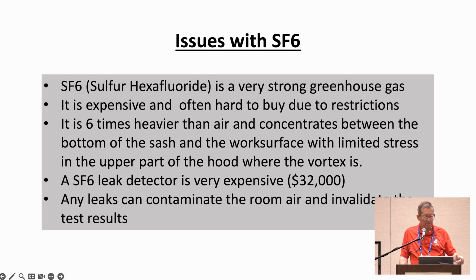So by the way, when the wind blows it back into the lab, then you don't know what's going on. You're failing the hood because of wind. You can't tell if it's leaking out the front because it's already being kept in the wrong. So your test is over for the day. You have to come back when it's not windy.